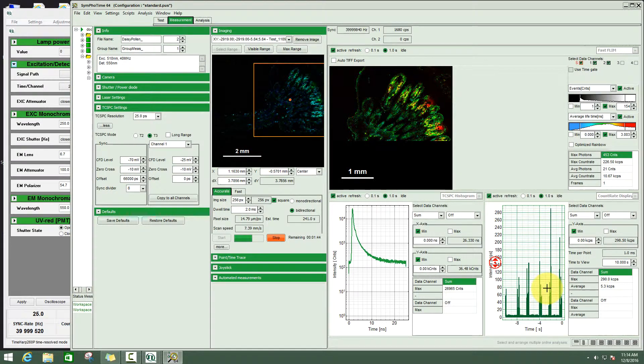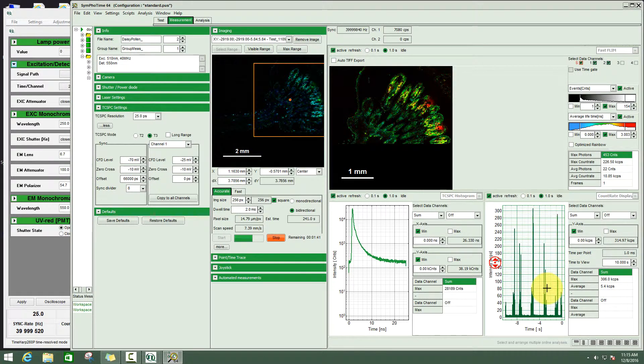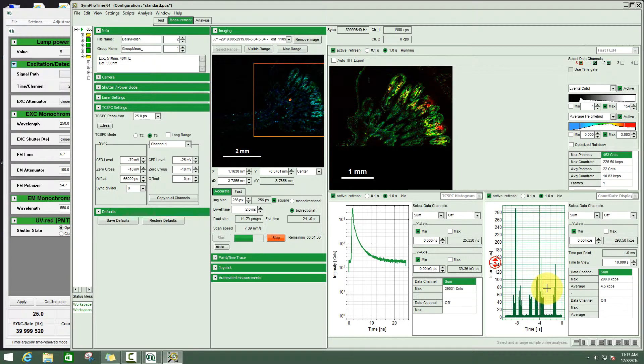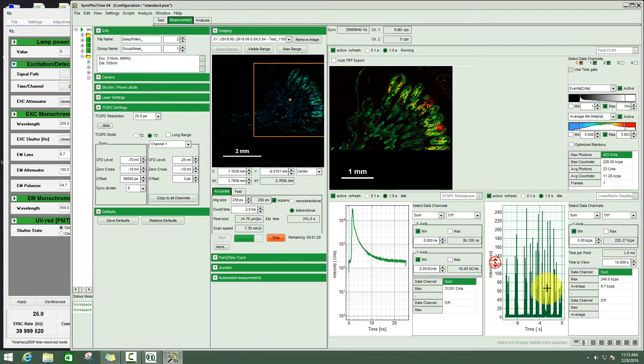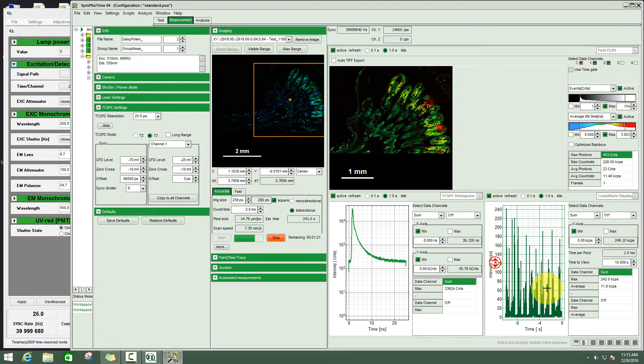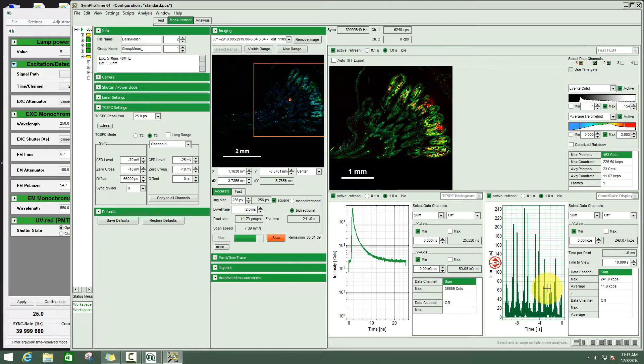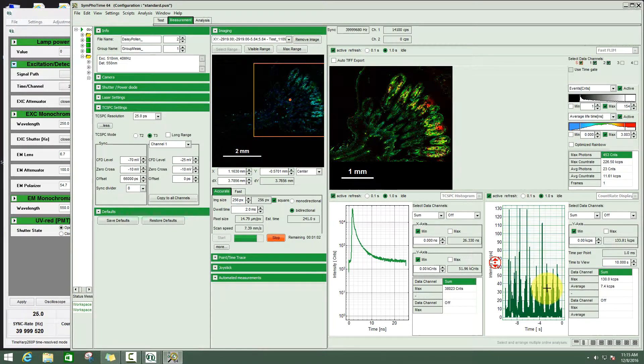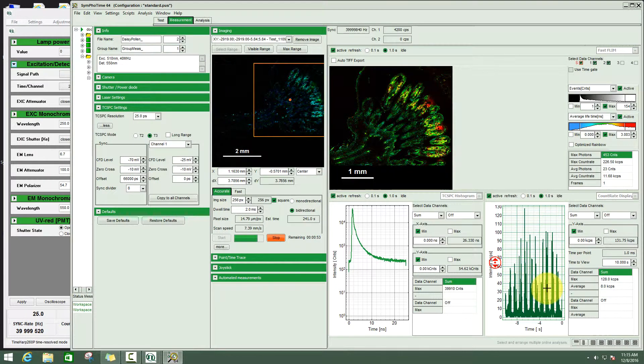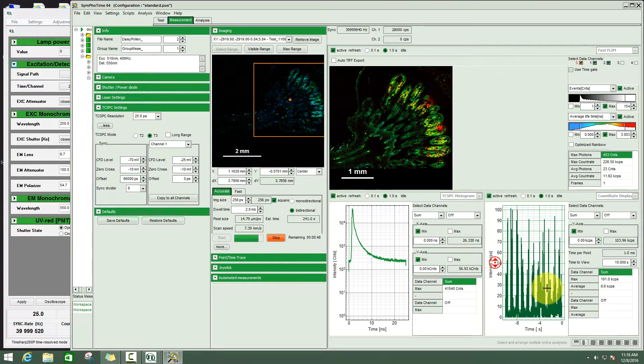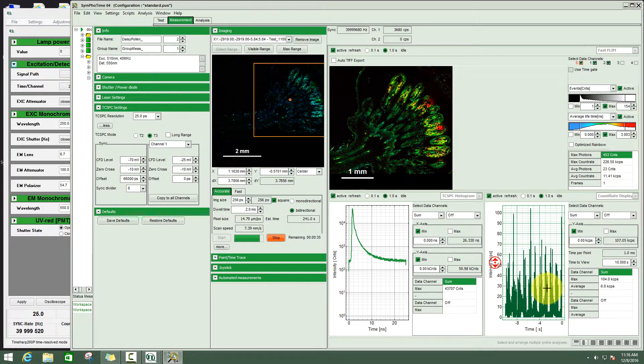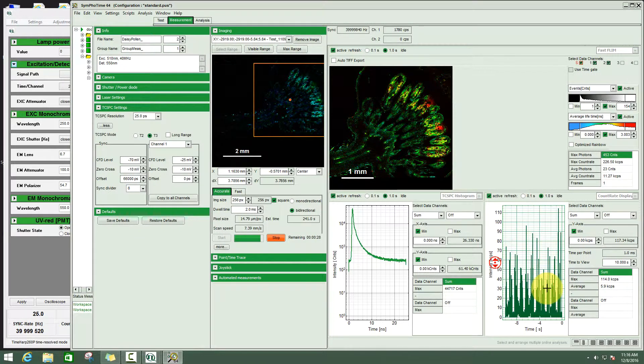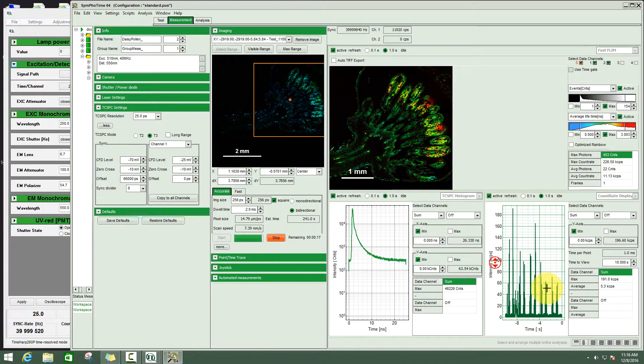Here we see the intensity fluctuations while the scanner is moving the sample through the excitation beam. The intensities we have here are still low enough that we don't have to worry about too high count rates that would falsify the lifetimes. This is the so called pile up effect. You can see nicely the form of the daisy pollen flower here.